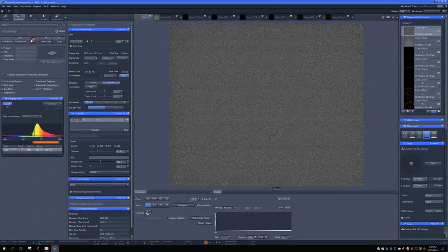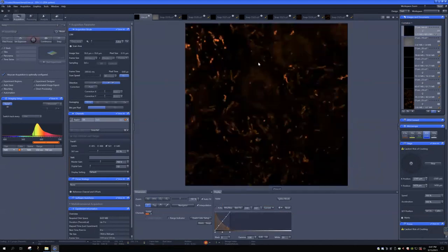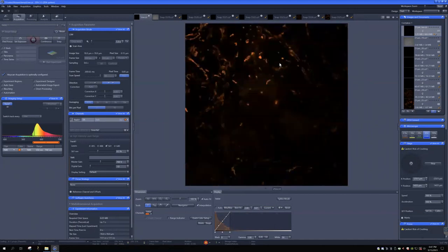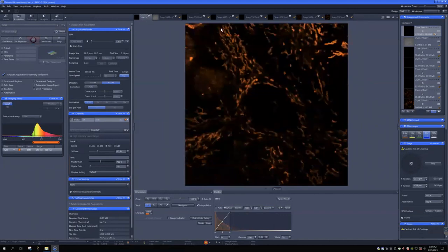So we just do a live imaging, and best fit. Oh, did you see that? Because right now it is high. Refocus. You can notice that the cell size, we can see very clearly, like this whole range is one cell. That is how we can see more detail in the cells. So let's say I'm taking a picture of this one, here is the nucleus, here is one very clear cell. We do an image on it.